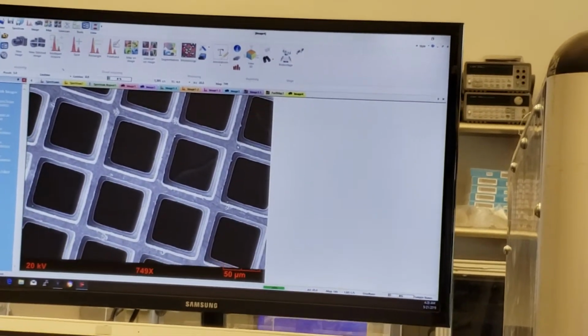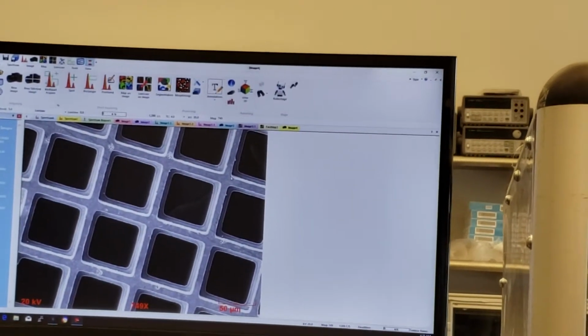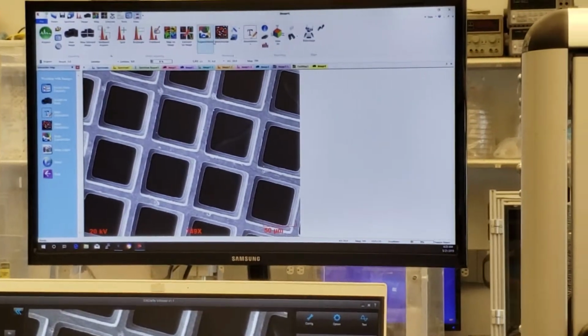That camera's going to be stable. Yeah, it's stabilized now. It was the initial outgassing of the gun, because I had alcohol in there. I cleaned that off, so that's what it was. It needed to outgas.